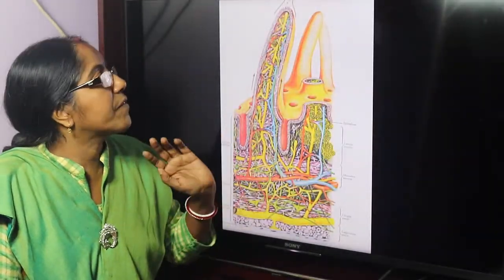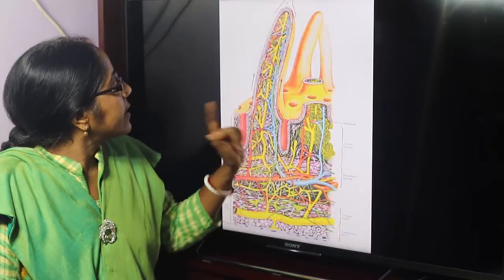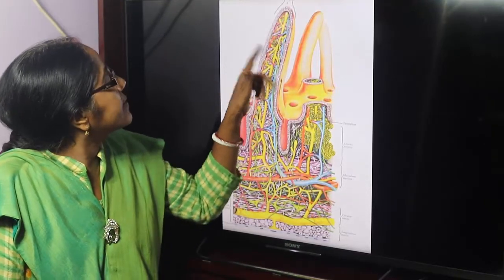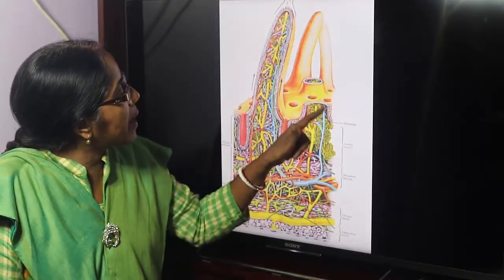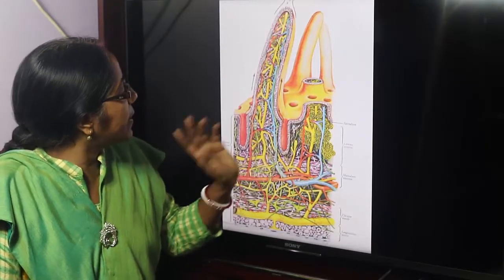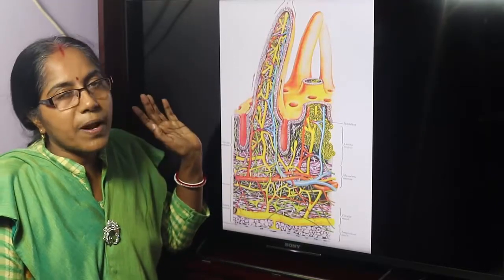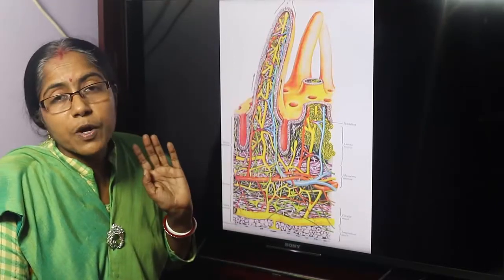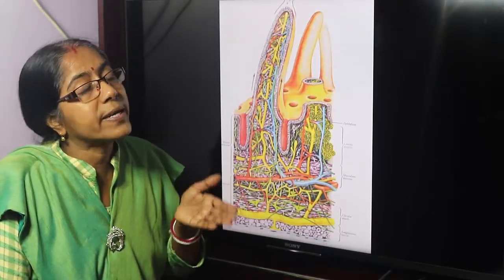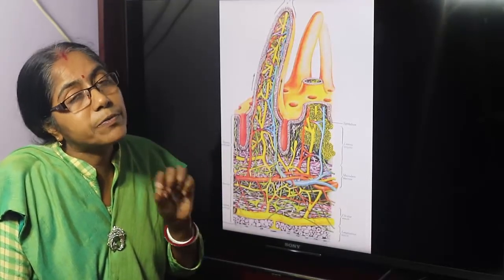This is the structure of the villus. This is the central lacteal. This is the venule. This is the arteriole. This is the smooth muscle fiber and this is the lymphatic nodule. This is the lining epithelium — tall columnar cells with a brush border. This shows the increased outer surface area of the villus.